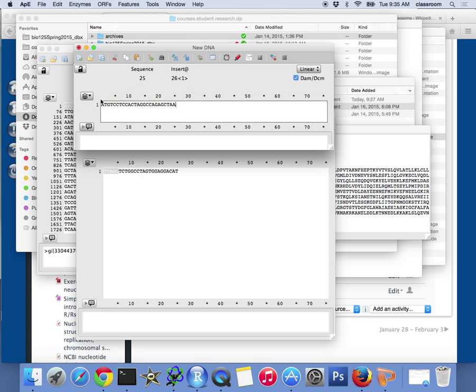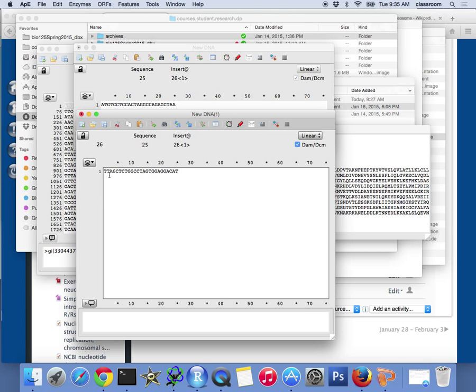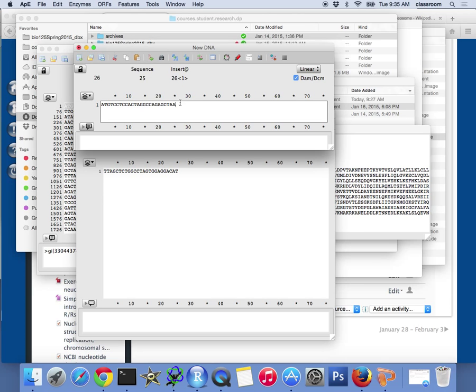We know the first one is 5' on the left and 3' on the right. The complementary strand is also 5', so this has to start from the right-hand side on the top sequence.